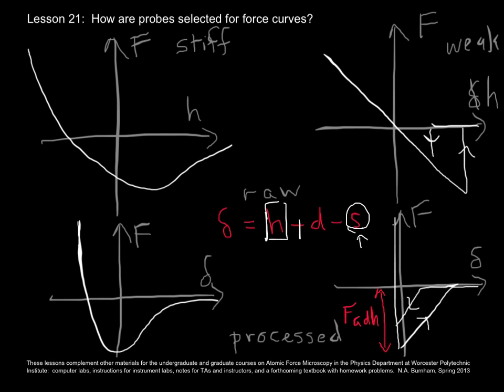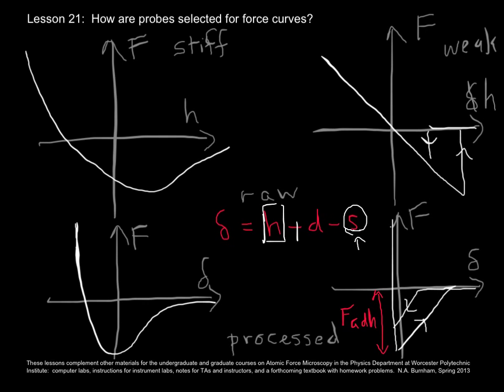So you would just go like this, or this, depending on whether you want the positive direction to be into the sample or away from the sample.